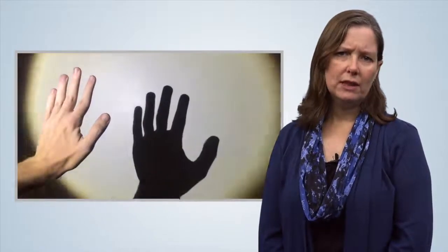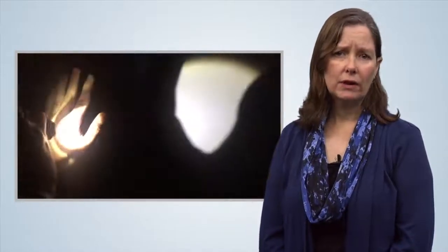This is comparable to shadows on a wall. The closer an object is to a light source, the more magnified it will appear on the wall.